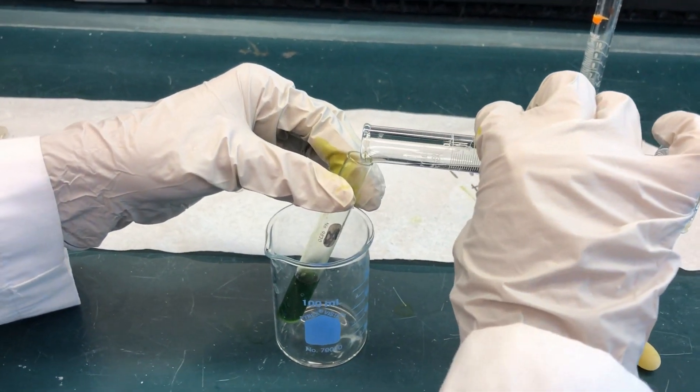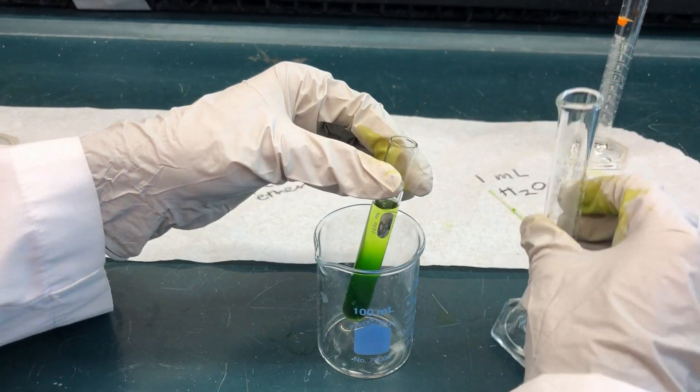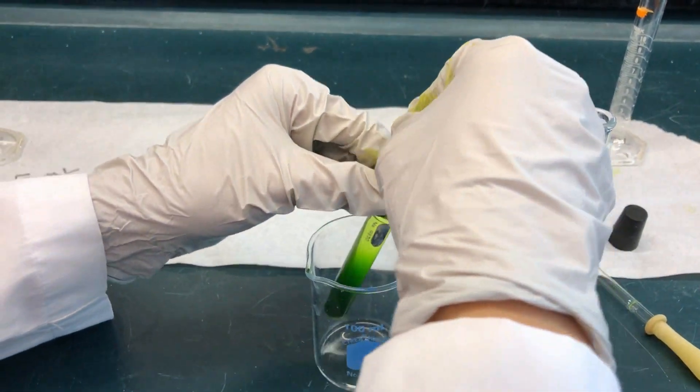Add 4 milliliters of petroleum ether to the new test tube. Stopper and shake for a minute.